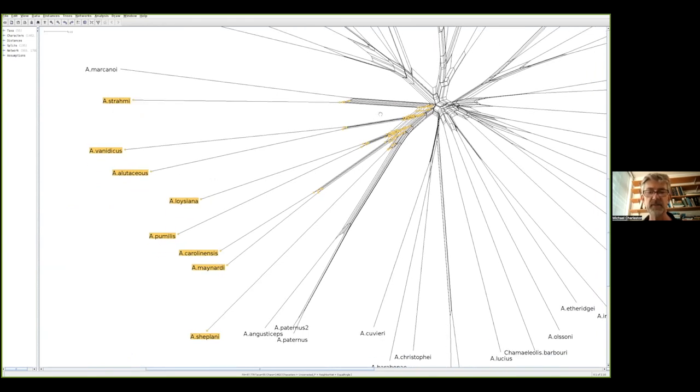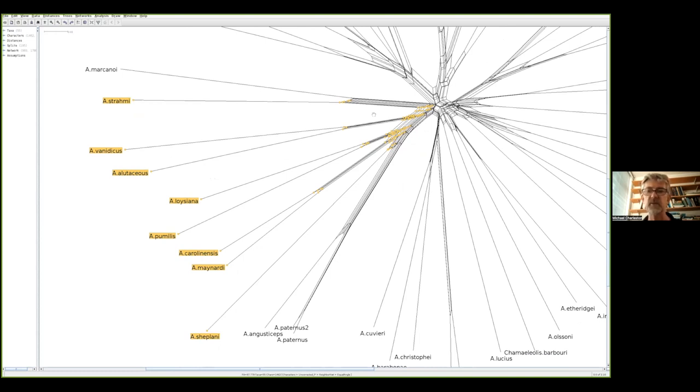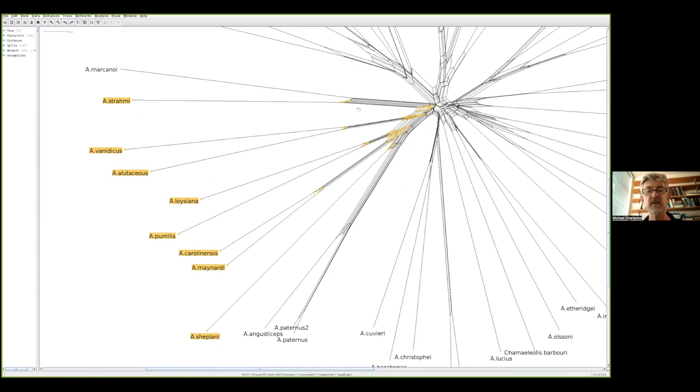In a phylogenetic tree we can only see a set of compatible splits, relationships that fit on one tree. This is one of the big advantages of having a phylogenetic network. It shows you more of the complex information that separates species in different ways that can't fit on the same tree.